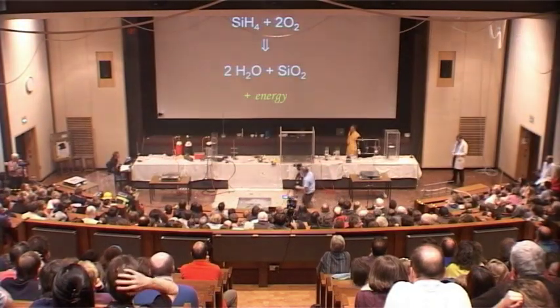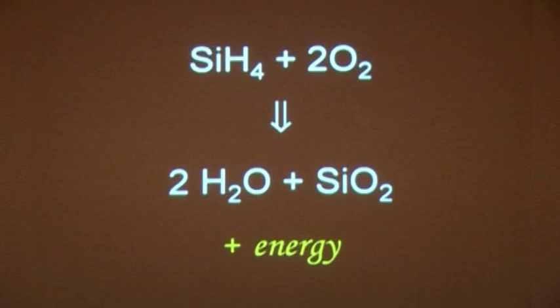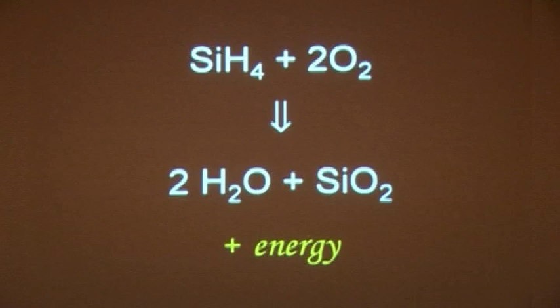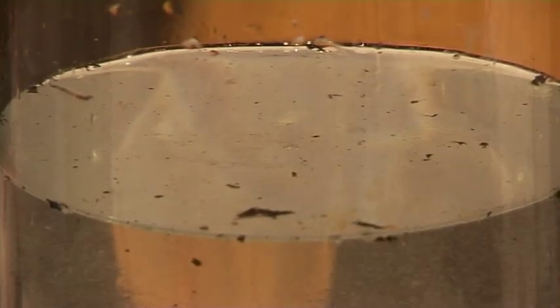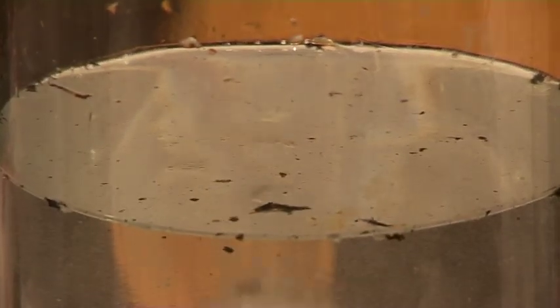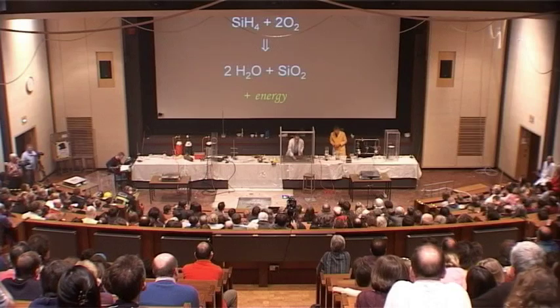Silane, SiH4 — so this is silicon now in place of carbon. This gas reacts with oxygen to form water and SiO2, silicon dioxide. So this will carry on; we'll hear some crackles from this throughout the rest of the lecture as these gas bubbles come to the surface.